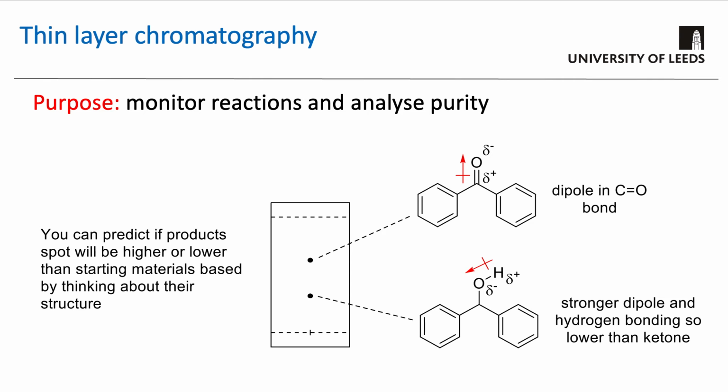Okay, so that's how we can use thin layer chromatography to work out which one of those three compounds your unknown sample is. It's a very standard technique for analysing what compound you have in organic chemistry.